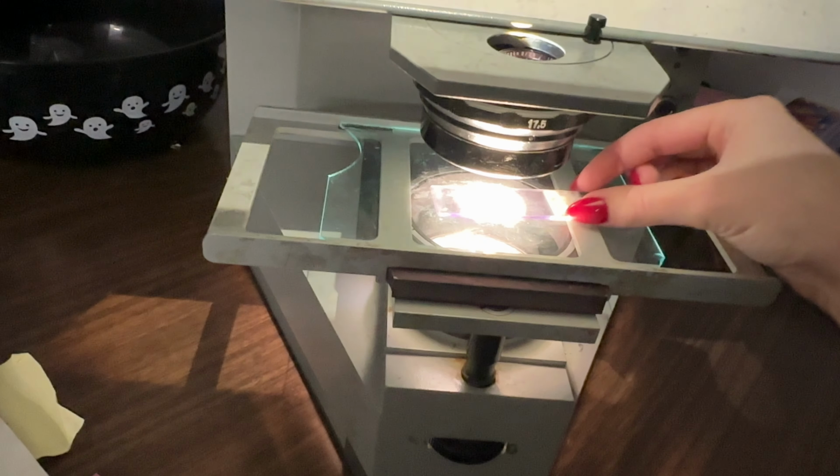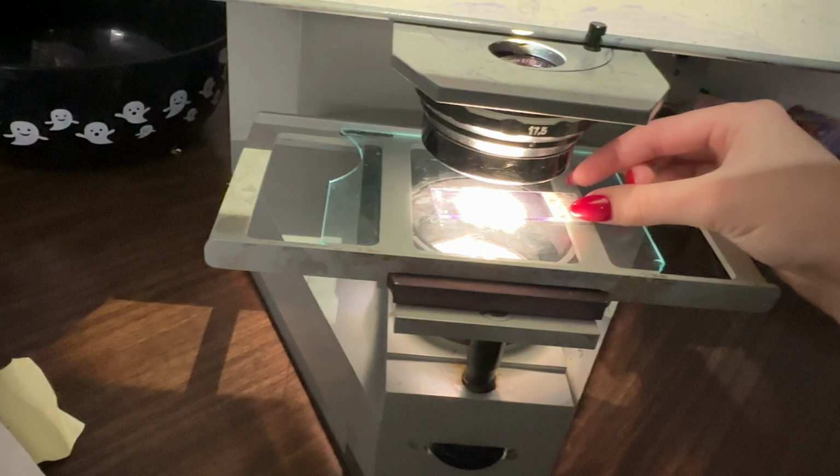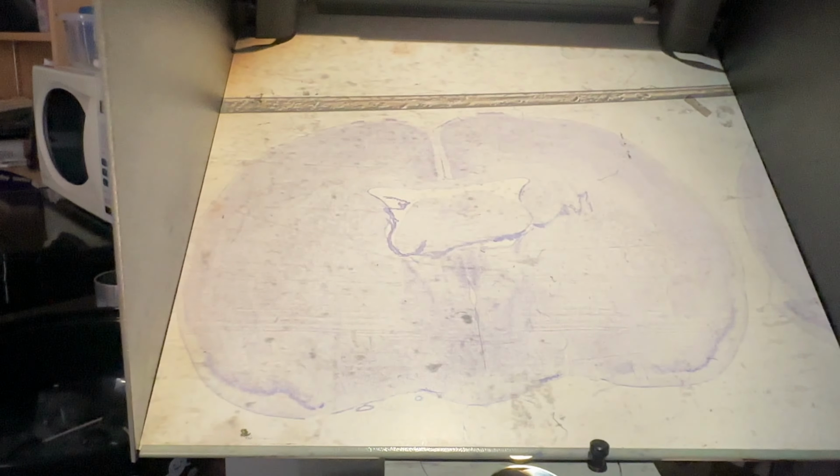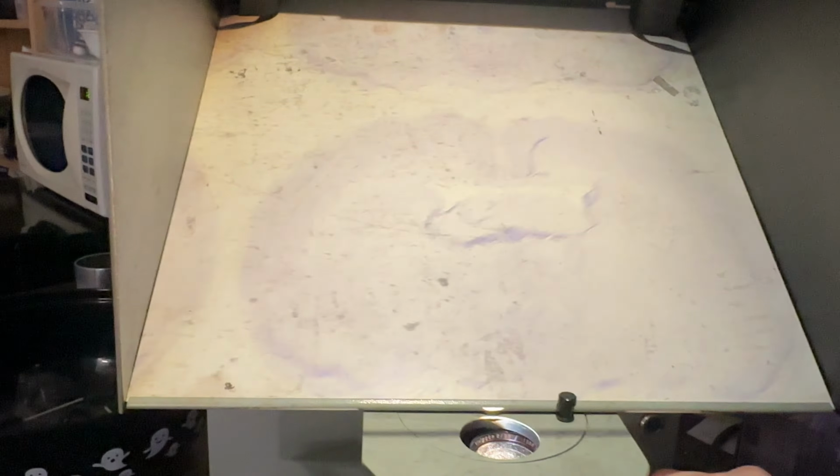We're finally getting into probably where the amygdala starts, and the student just wanted me to check her work to make sure that it was looking like she had the right area of where the amygdala started. So it's looking good to me right now.